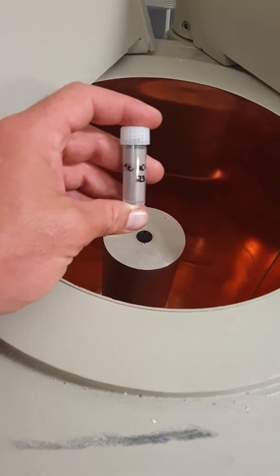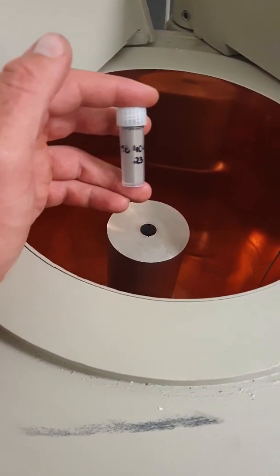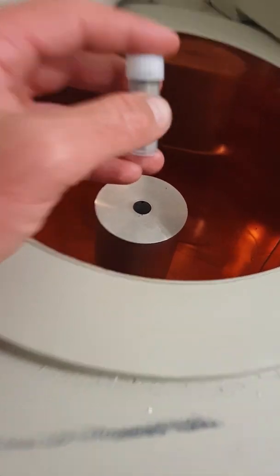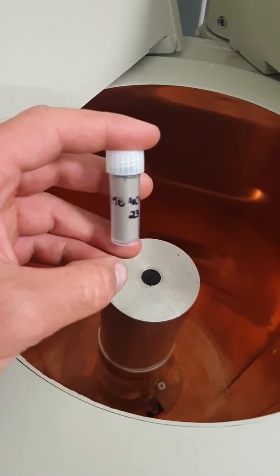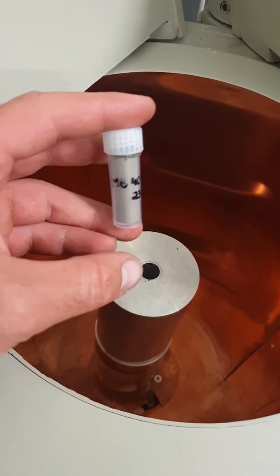This is a high purity germanium gamma detector. It's used to sample sediments and radioactivity within the environment.